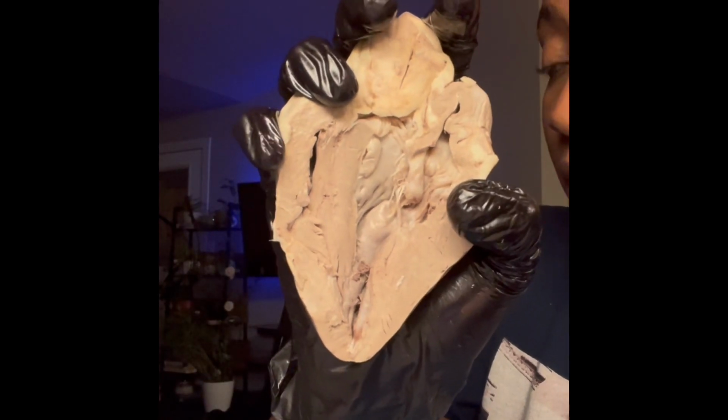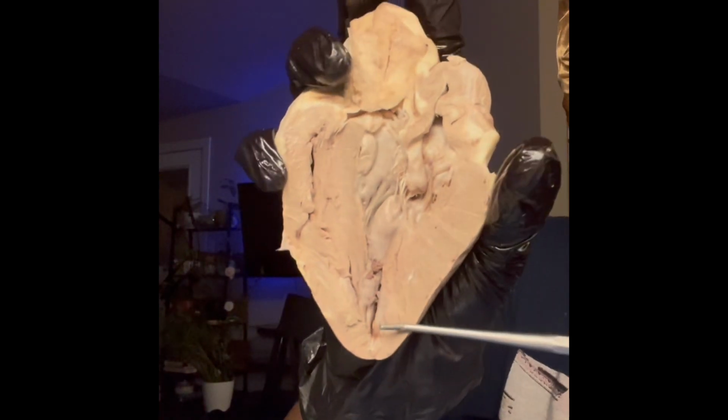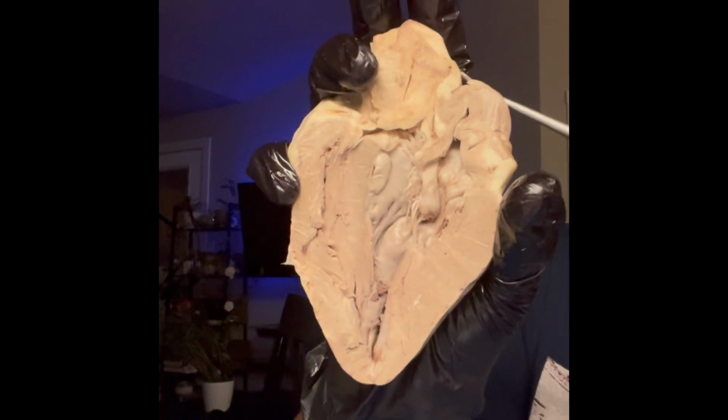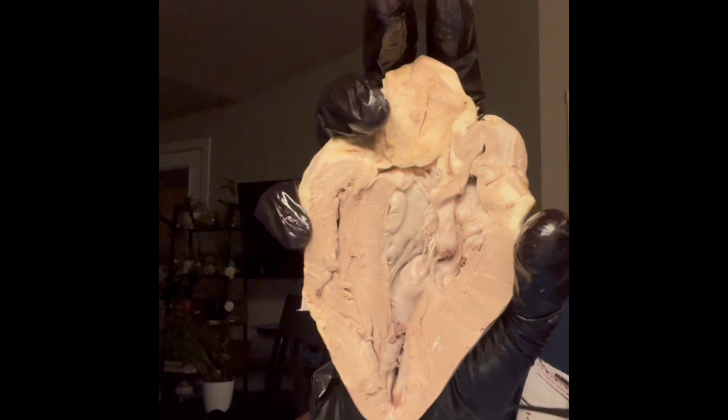My name is Denise, and this is a dissection of a sheep's heart for Anatomy 2. This is the apex of the heart, and this is the base. The base is a point of attachment for blood vessels entering and exiting the heart.